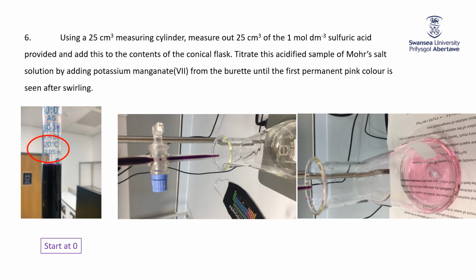So in other words, I've reached the equivalence point of the titration, and now you can see the end point, because that last little drop of the potassium permanganate that I added didn't react, and so it stays purple, except of course it's so diluted, the diluted purple is pink. Okay, so that pink color is unreacted potassium permanganate because I'd used up all the Fe2+. How much potassium permanganate did I have to add?